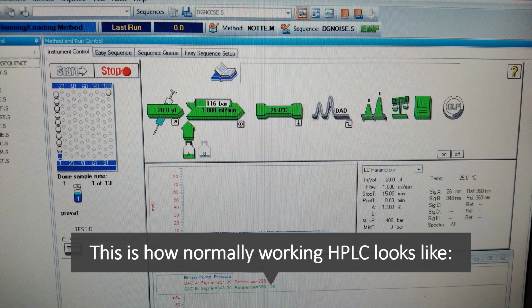There is this mistake that I wanted to highlight in this picture: the liquid that you are using in the A vial is very low. In my opinion, as I told you in my earlier video, you should be very careful when you are going to put your samples. The day before you plan your study, you have to make sure that your mobile phase and your ultra pure water, like in vial A and B, are filled, and everything else which is needed for the experiment is okay.